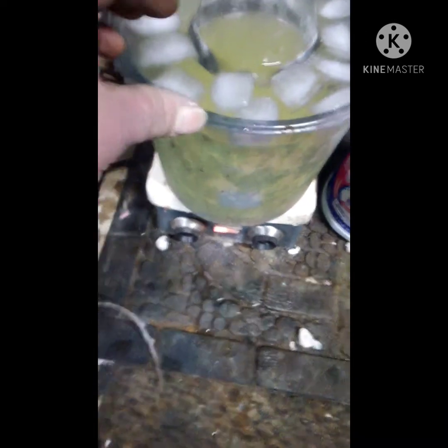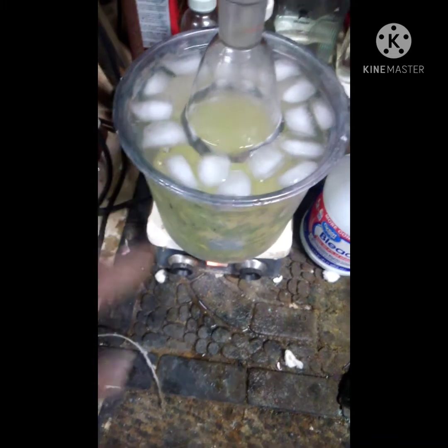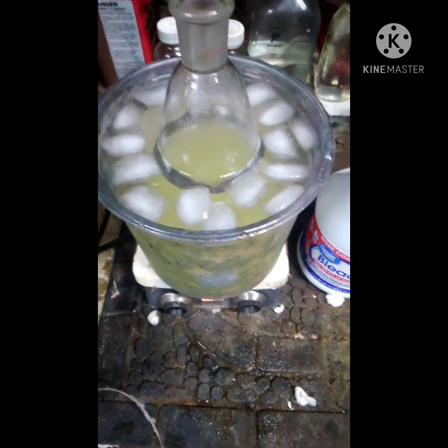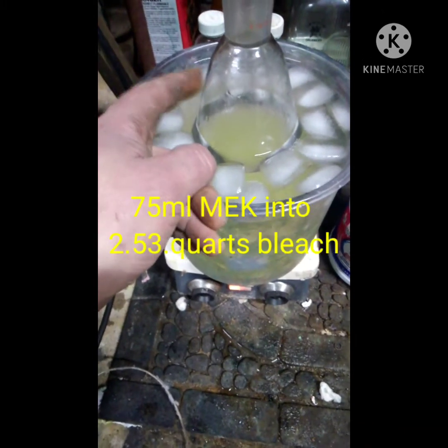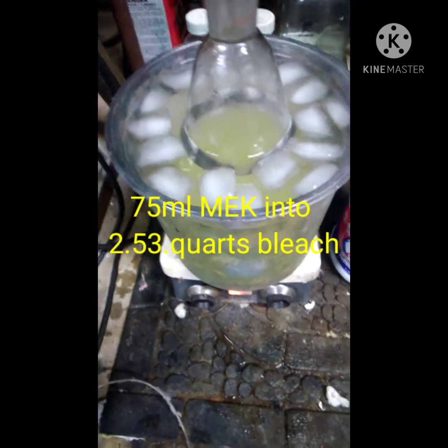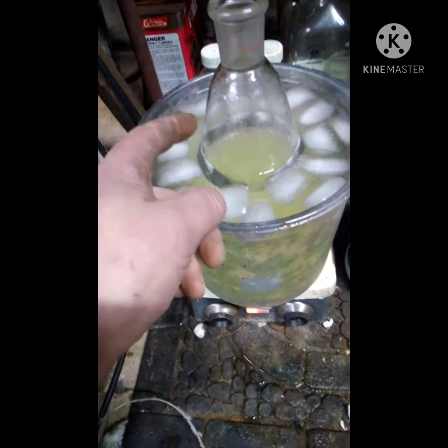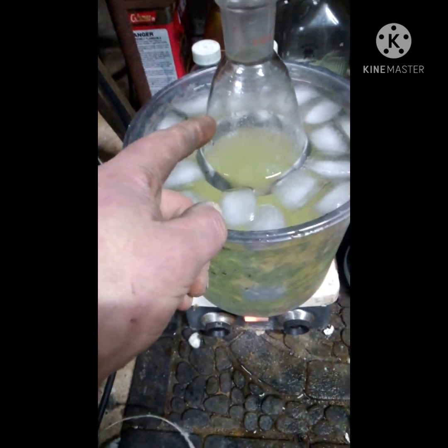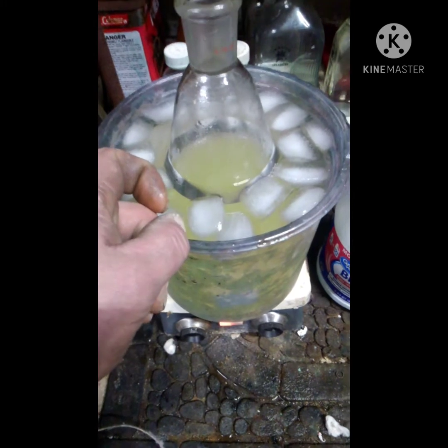I've got my chlorine sitting in this tub here, with water and ice to keep it cool because this reaction is very exothermic. Now I'm going to put about 75 milliliters of MEK into this container, and I also have a stir bar going in. The chlorine will change colors - it'll almost go clear and then darken back up.